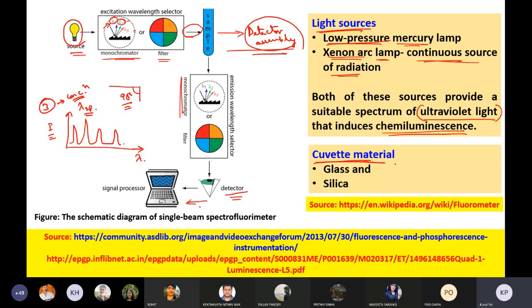Then the cuvette materials, if you are planning to work only in the visible region, then glass is sufficient. Glass cuvette is sufficient. However, if you want to work with the ultraviolet region also, then you need to use silica based cuvettes.